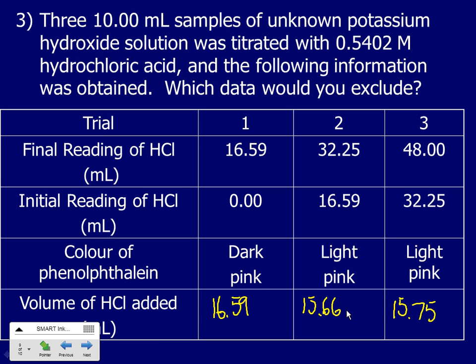Here, you've got 2 of them. And actually, we usually want 3 that are really good. I would say do another titration and make sure you get 3 of them that are good. Okay, so let's solve this one. What's the average of the ones that we're going to keep? In other words, not keeping that guy.